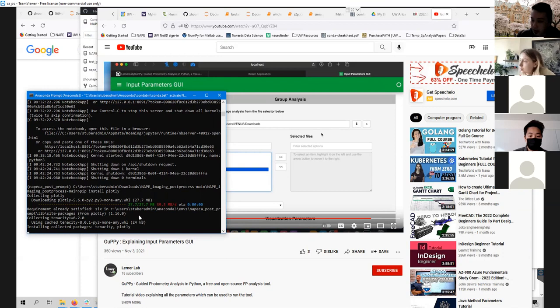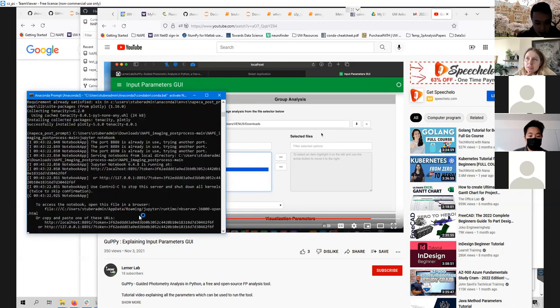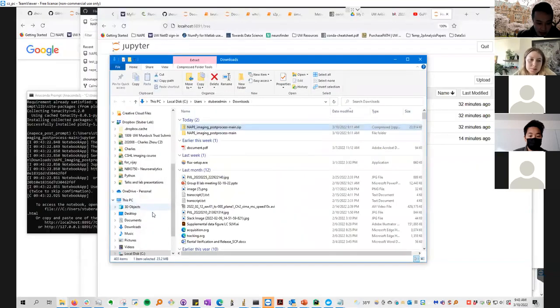Oh yeah, so for the Inscopix data, what's the format of the extracted traces? Yeah, it's like a data frame. The first column is time, and then the subsequent columns are just the ROIs in there. Okay, so then it should probably look something like this, right?